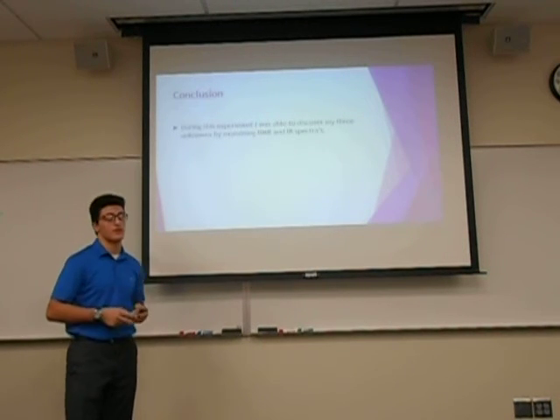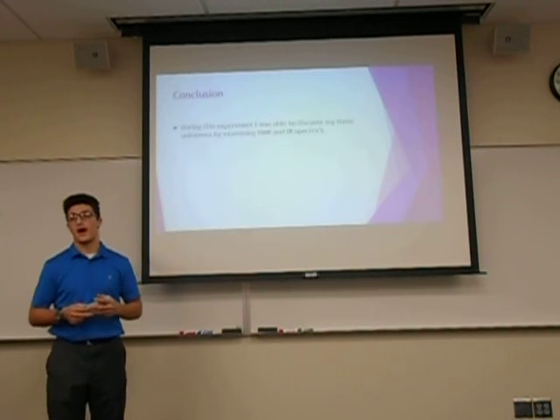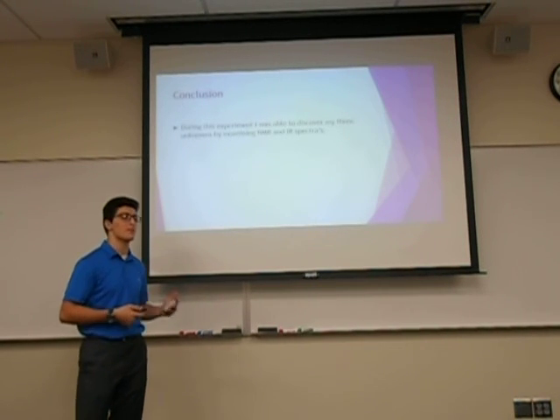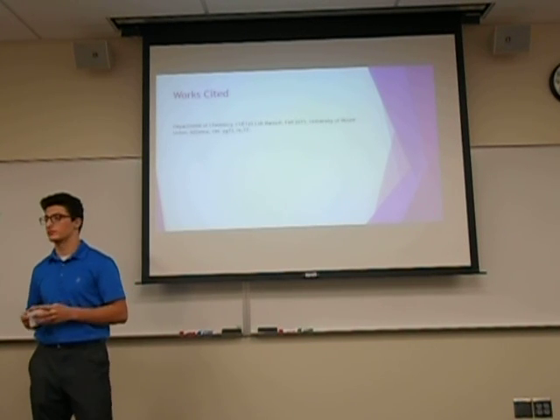Alright, so in conclusion, what I learned throughout this experiment, which you should learn too, is how to use IR and NMR spectra, and how to examine them to identify any unknowns, any molecules that are given to you. And there's my works cited.